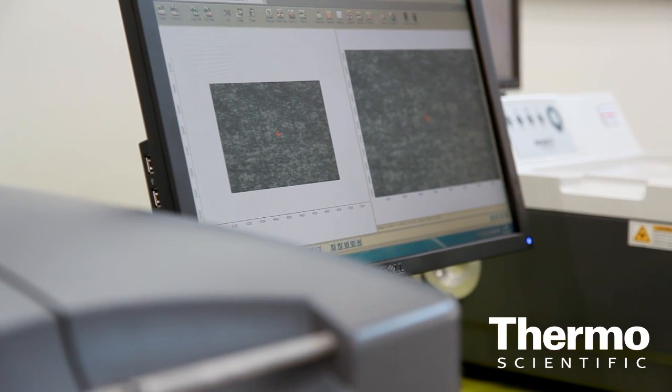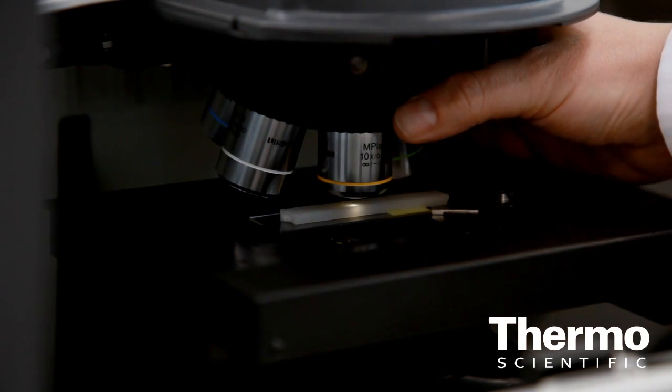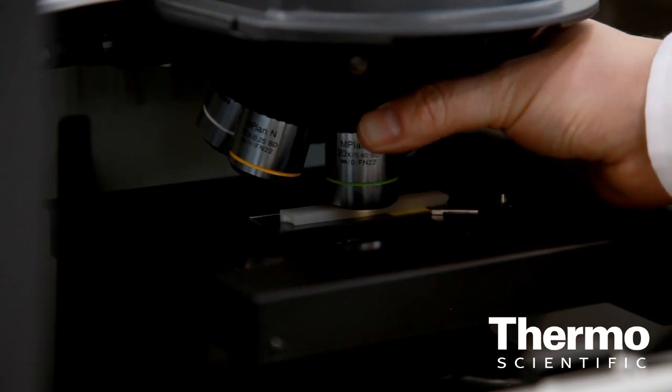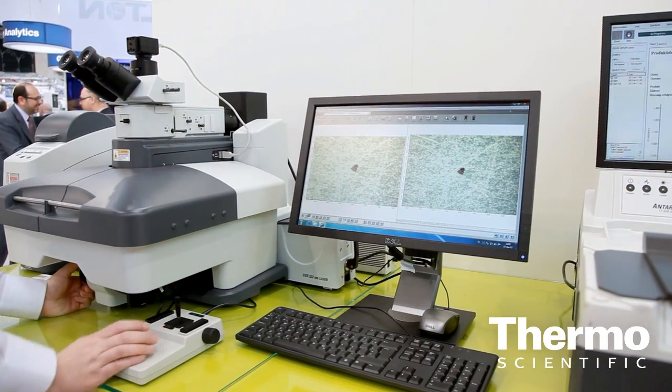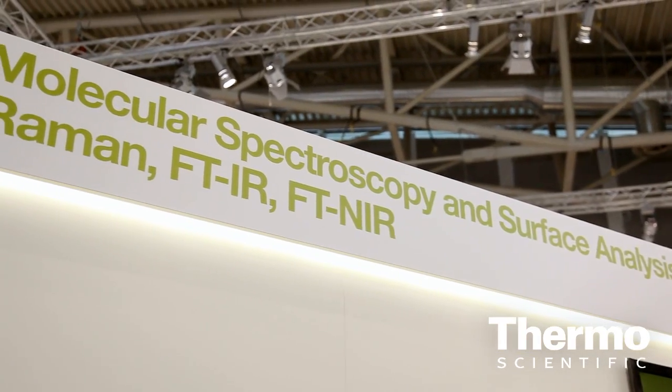Especially here, you can identify impurities like this one in a polymer matrix. There are small particles, there are small impurities here, and you can identify these small impurities very fast with this Raman instrument. We have here a glass objective, which means you can measure directly through the objectives. You have a very crystal clear picture and you can identify small particles directly through these objectives.